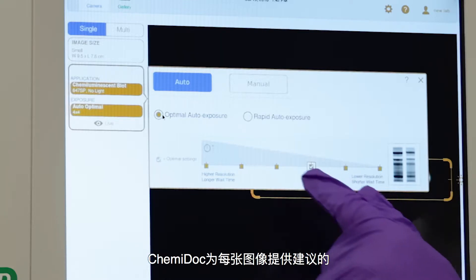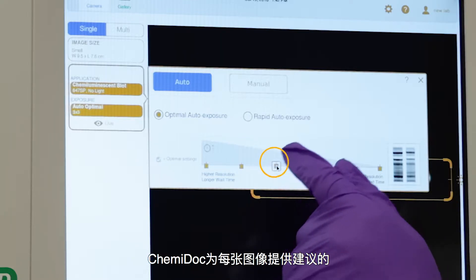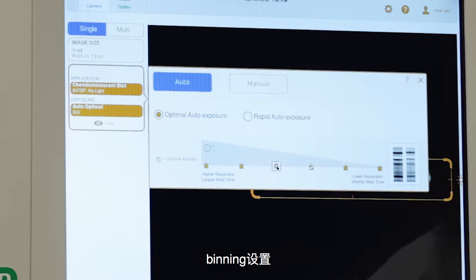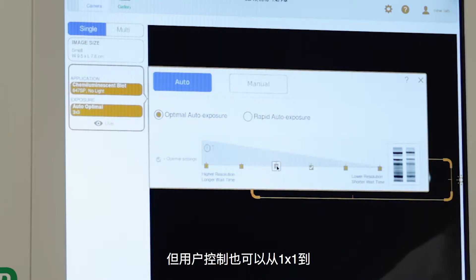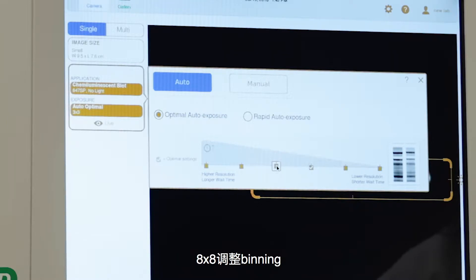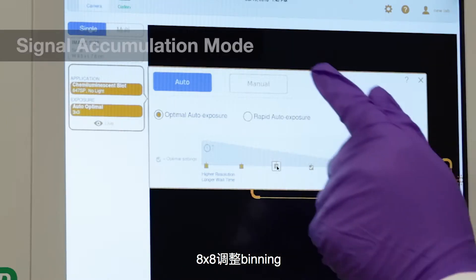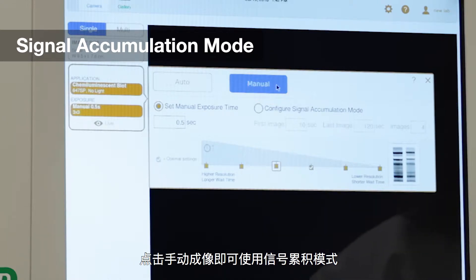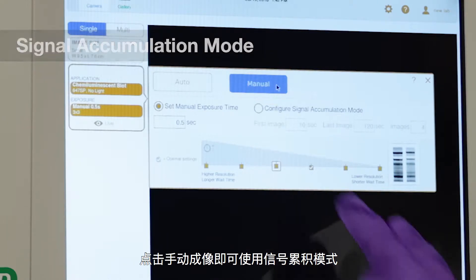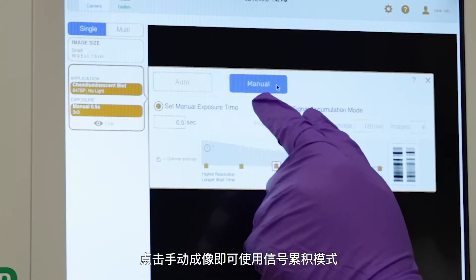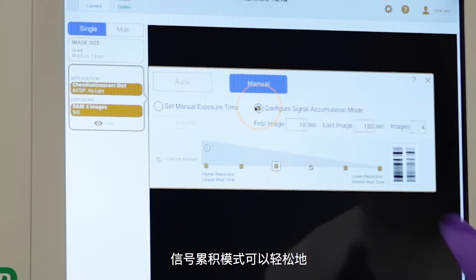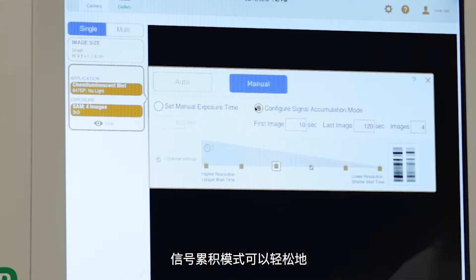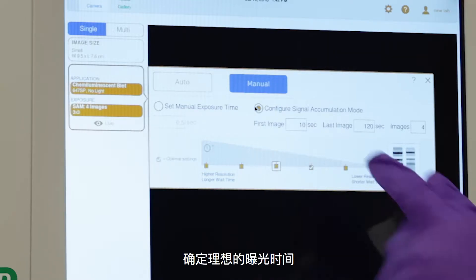The Chemidoc provides a recommended binning setting for each image, but user control is enabled to adjust from 1x1 to 8x8 binning. Select manual imaging to access signal accumulation mode, which makes it easy to find your ideal exposure time.